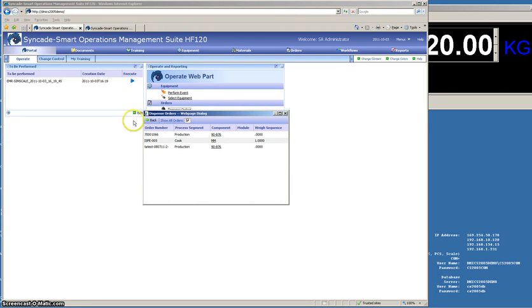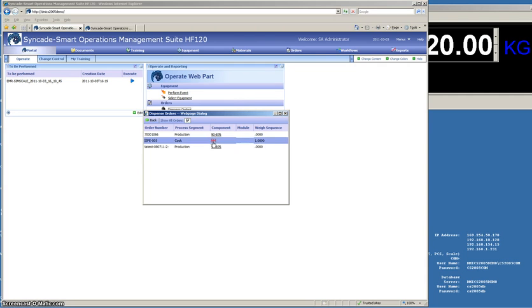So if I take a look here, we have a couple orders that need to be dispensing, but I'm going to grab the order for the M&Ms.